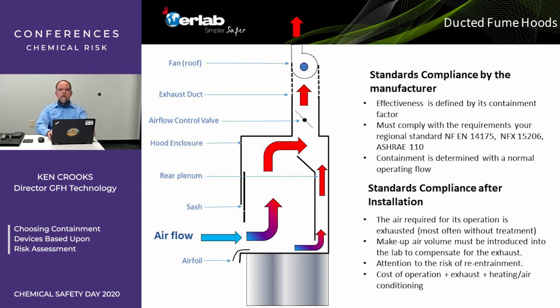So what about after installation, right? It's important that air is always there and it's always exhausted or filtered and returned to the lab, depending on the type of hood. If it is exhausted, you must have makeup air. You cannot exhaust what you do not make up back into that laboratory. And that's where that high operating cost comes into play.